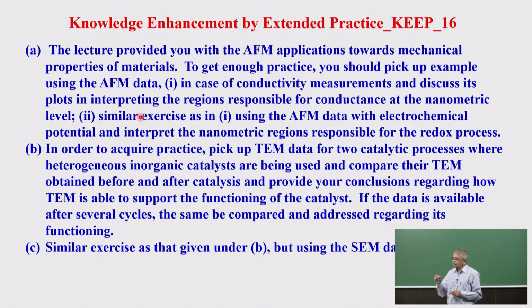So there will be plots which show you the region, just like here we showed in this example their tensile strengths, Young's modulus, these kinds of things, and then also their adhesive force regions. So you can make the contour plots. Those kinds of plots, contours, you should try to interpret and try to correlate the material surface structure with the properties of that.